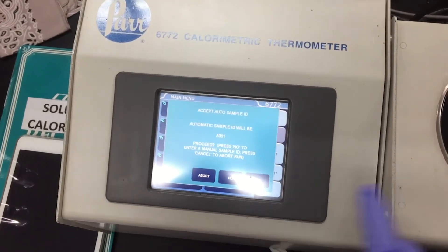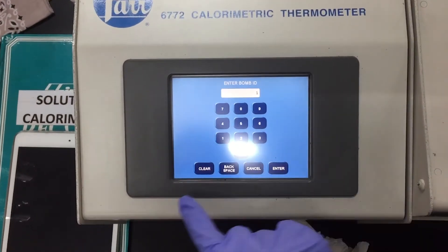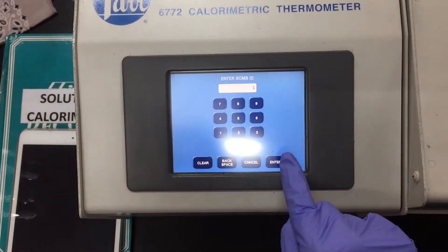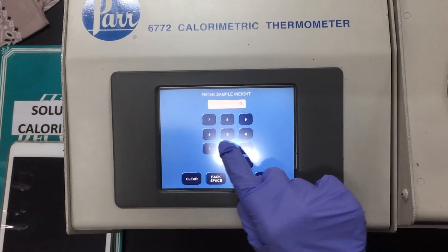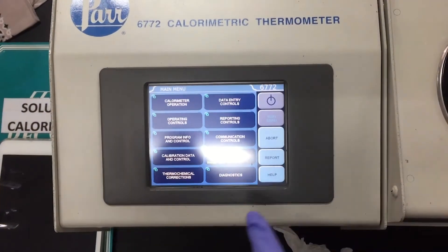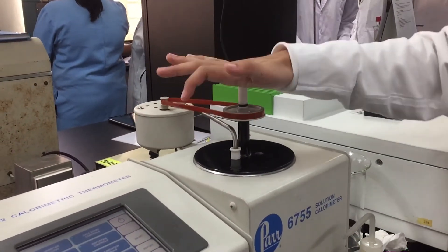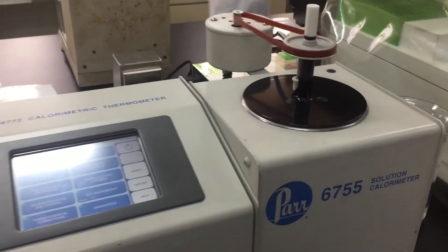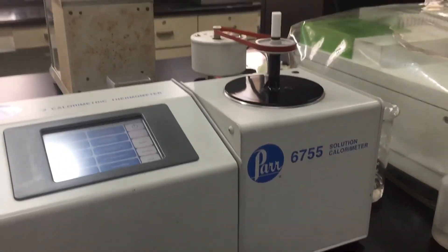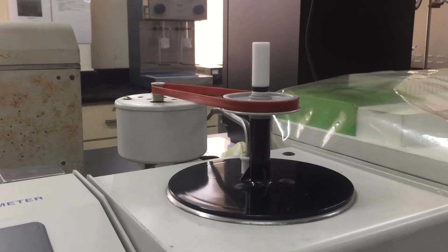Pressing the start button will make the machine work, and putting the value of the sample weight in the tap loading balance allows the machine to compute for the heat of the solution. After hearing the first beep of the machine, press the push rod, and after the second beep, the process is done. Record the data that is displayed on the machine after the process.